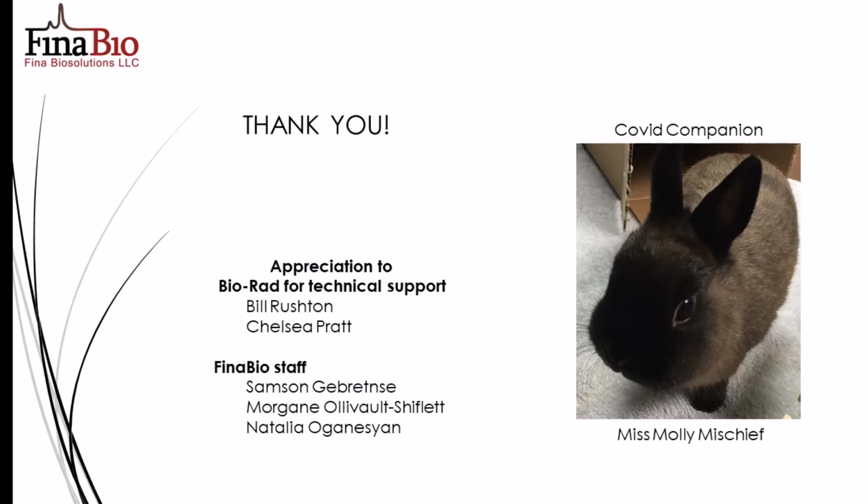Okay, great. And why does MacroPrep High Q provide lower dynamic binding capacity than the Nuvia Q when it is the highest measured ionic capacity? Yeah, that's a good question, because that was a little surprising to me. I really thought maybe we'd get higher binding capacity, but on discussions with the Bio-Rad technical staff, it seems like the reason is that the newer resins like the Nuvia have a more optimized pore size.